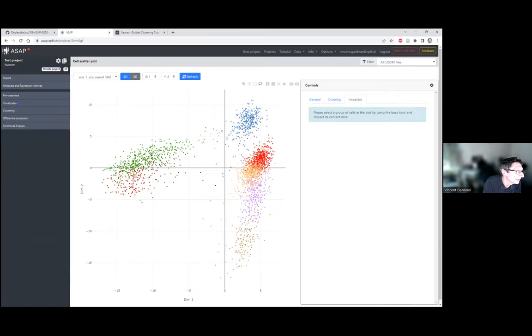I have data that was processed earlier, clustered and annotated by experts. When I do the clustering again, I'm getting different numbers of clusters. Yeah, that's the case. Clustering is very, very arbitrary and random as well. So it may depend on the version of the packages. So that's why actually we keep all the versions of the packages, because sometimes you change a version of one package and then you change completely your clustering results or your UMAP, or it can change a lot, even if you use the same seed.